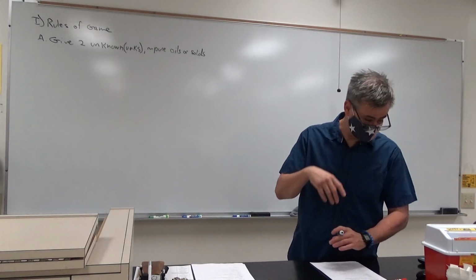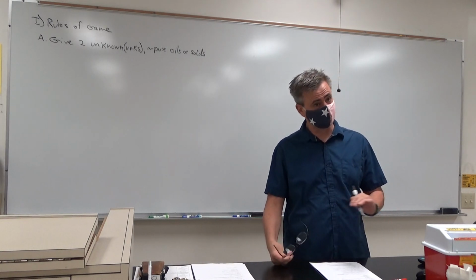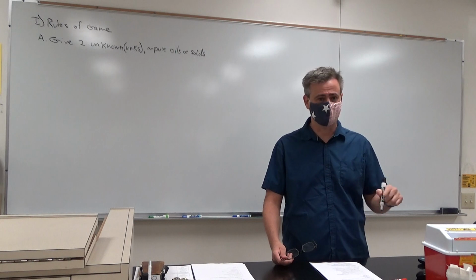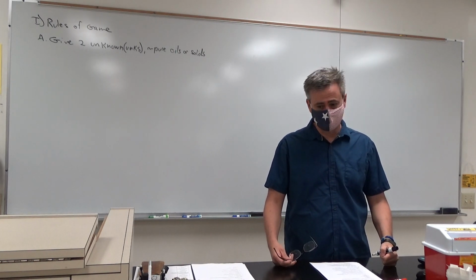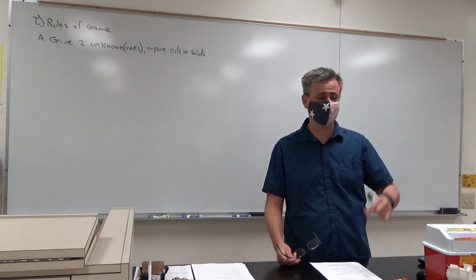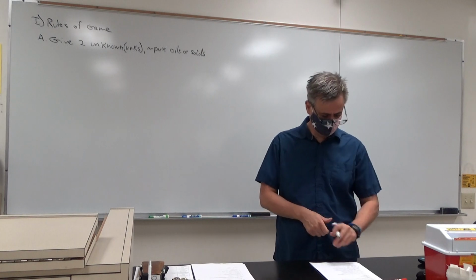Before I forget about this, you are going to take a melting point or a boiling point, but you're only going to take one. So if it's a liquid at room temperature, you're going to take a boiling point, right? And I'll teach you how to do a boiling point. Probably not this week. I want to get going on getting the lab started. But next week I'll teach you how to do a boiling point. But if it's a solid at room temperature, you end up with a little solid, then you're going to do a melting point.